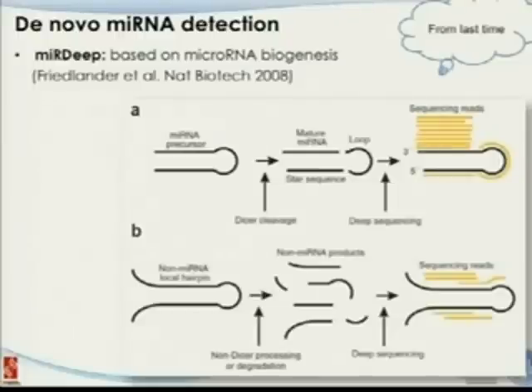You get the microRNA, you remove the linkers, and then you map it against the genome. If there's a region that is already mapped to the existing database, great. If not, the next step is probably to search the local sequence area for hairpin loops, right? And if they happen to have pretty strong signals and also form local hairpin loops, you are probably pretty confident that there's a microRNA there.